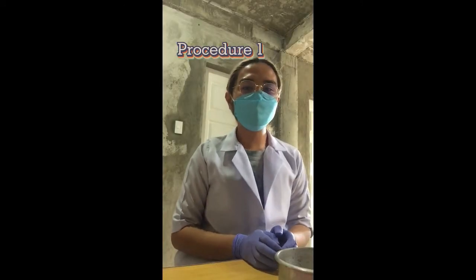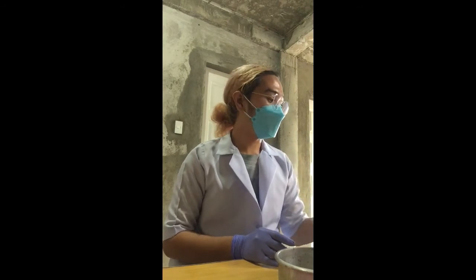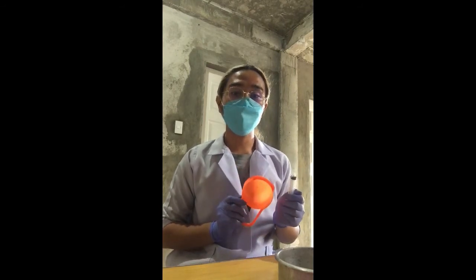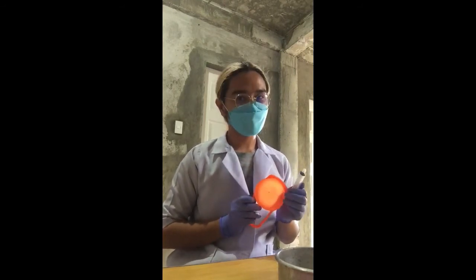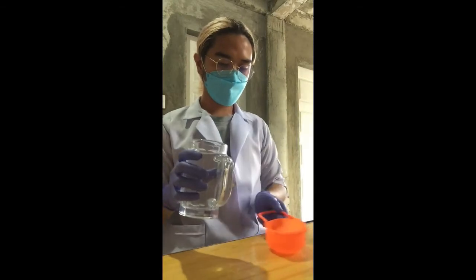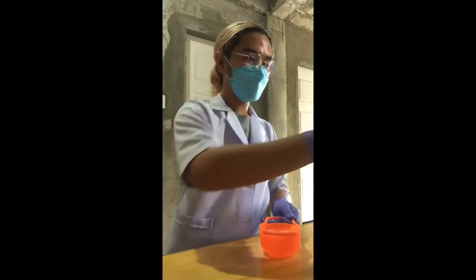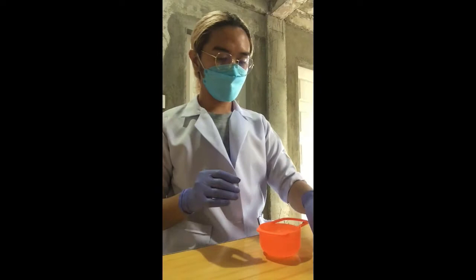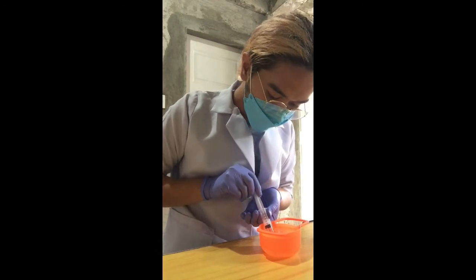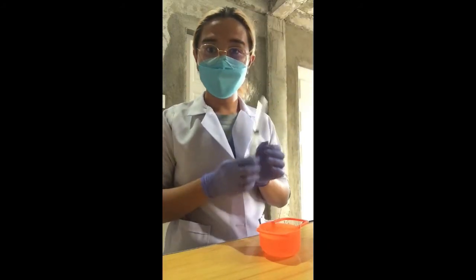Okay, let's start the procedure number one, measuring the volume of liquid. I'm using a 250 mL measuring cup and a 10cc syringe without needle to measure the volume of liquid. Start. That's it!